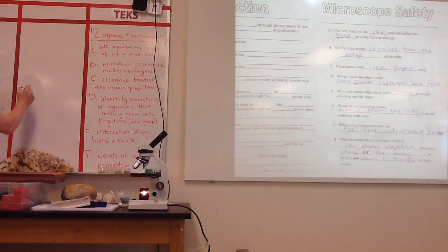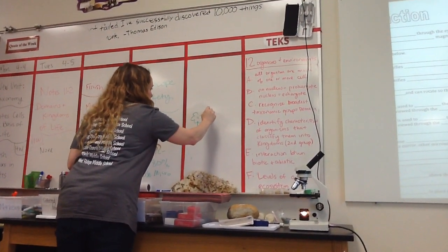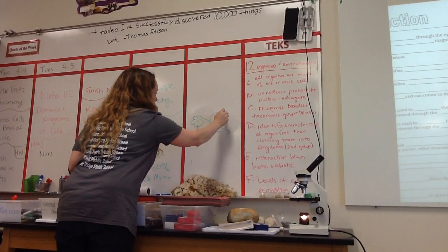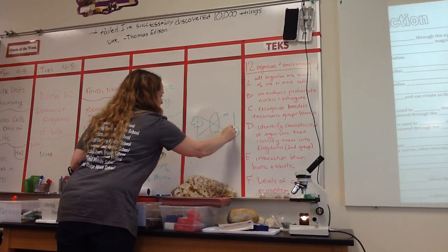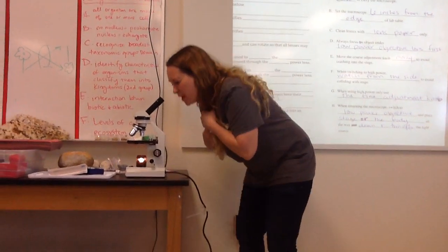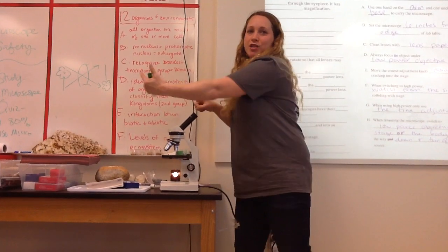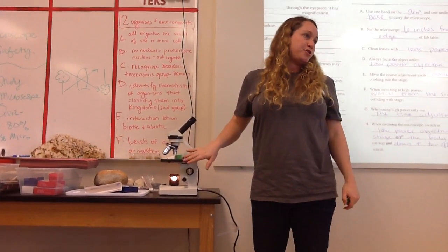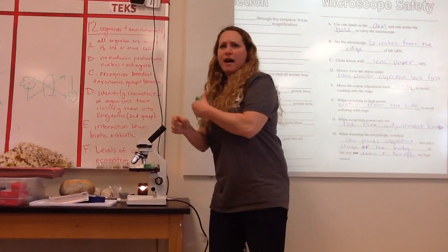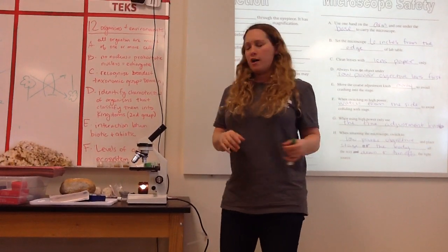So if it's a flower, and you look through a lens, then this part goes right there, that part goes right there, and you end up looking like the flower's upside down, but it's really not. So when you're looking at the image and it's looking flipped, you think you need to do one thing, but you actually need to do the opposite. And when you use the microscope, you'll see what I'm talking about. It's kind of weird. It'll trip you out. You'll be like, I wanted to go right, and when I push right, it goes left. So it's because it's a flipped image. Does that make sense? You're totally going to freak out about it when you use it.